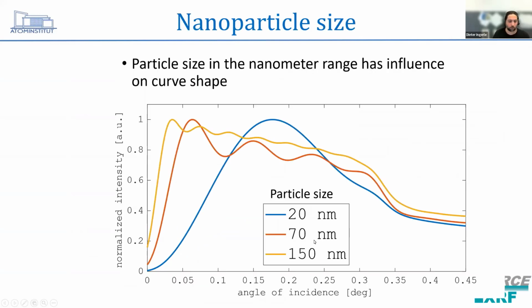So again, to come back also to the nanoparticles, I've shown this before. Here it's quite nice. We can also use this standing wave effect, or this interference effect, to determine the particle sizes, or try to determine them. Of course, there are some limitations. The particles should be spread out relatively homogeneously over the surface and shouldn't clump together and so on to make this work. But in the past, we already managed to do this with a relatively simple preparation technique, actually.